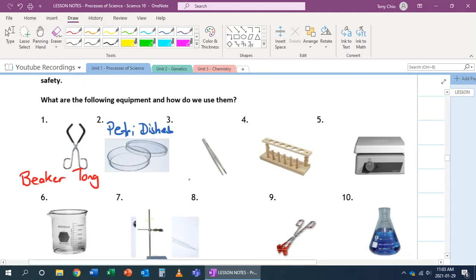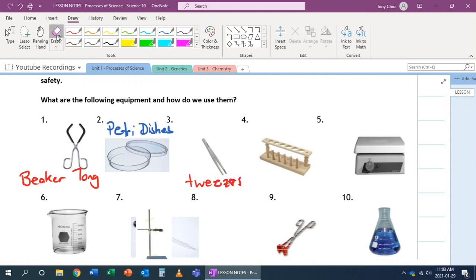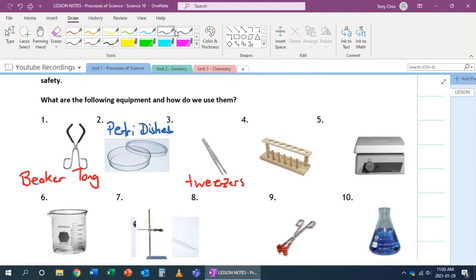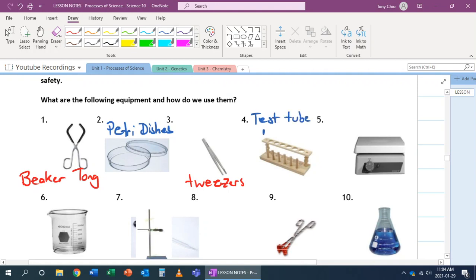Number three, number three is tweezers. Tweezers are used to pick up small items because sometimes your fingers are too large for that. Number four, this one is called a test tube rack.